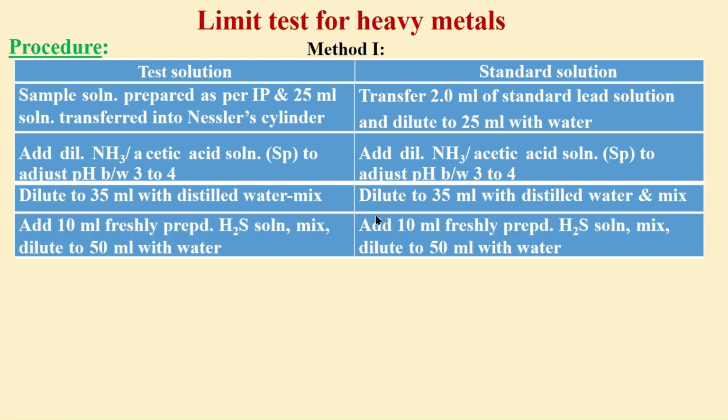This is followed by addition of 10 ml freshly prepared hydrogen sulfide solution, and the volume is made up to 50 ml by addition of water.